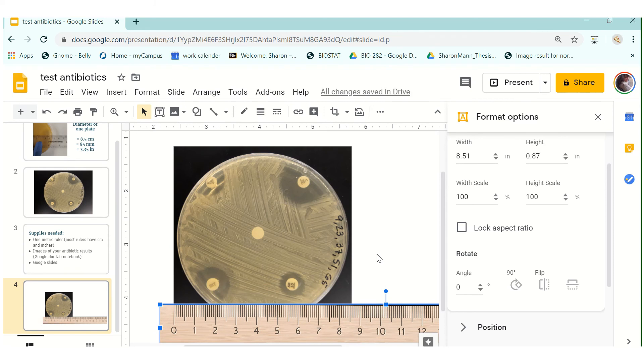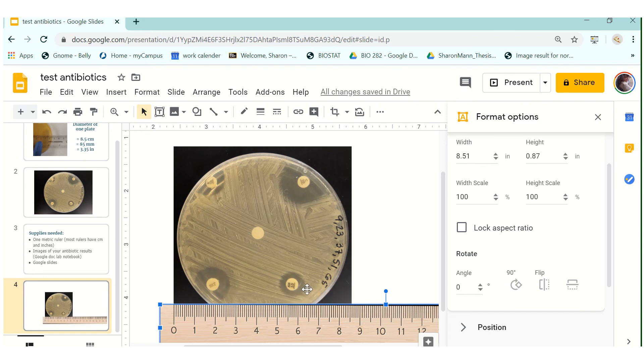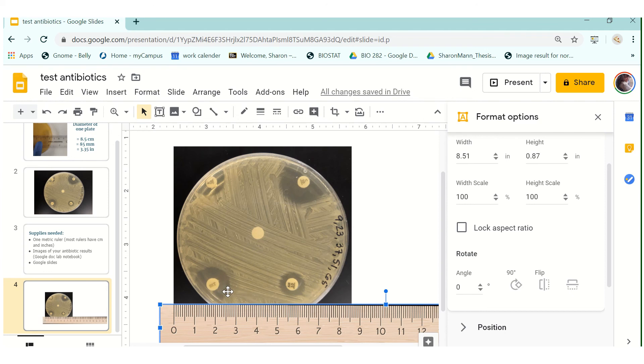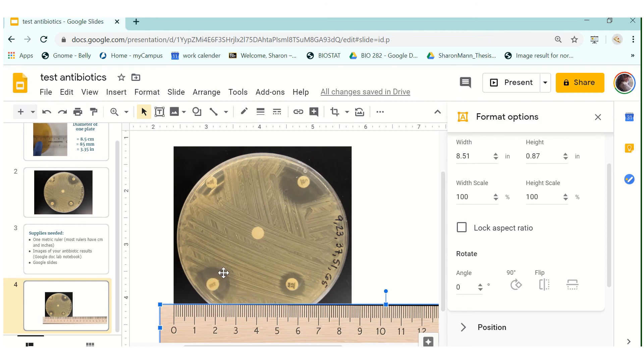So the last thing that I want to mention to you when you're measuring your zone of inhibition is that not all of your discs are going to have a perfect clearing around them where you can get the entire diameter. So from here to there would be the diameter, a lot of them are actually going to have only like a partial area like this because we fit five discs on one plate. So what you want to do in this case is to measure from the center of your antibiotic disc out to the clearing and that is your radius. So radius times two equals your diameter. This procedure is also listed in your lab notebook.